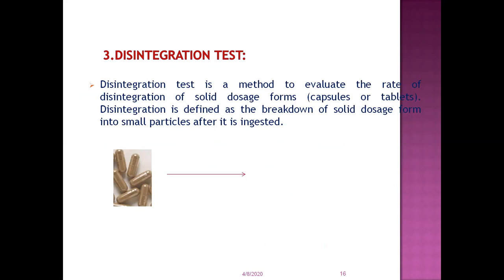And the third one is the disintegration test. In this disintegration test, the method is to evaluate the rate of disintegration of capsules or tablets. It is defined as the breakdown of solid dosage forms into small particles after administration.